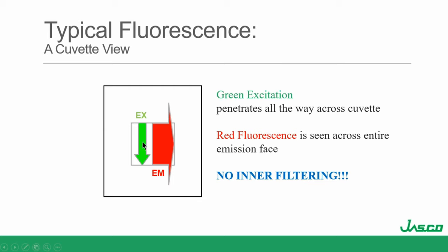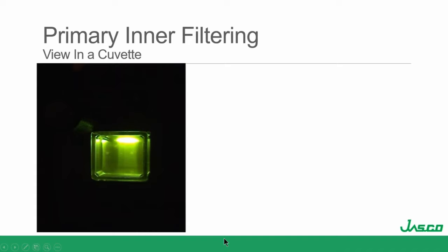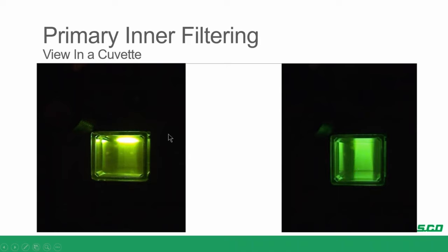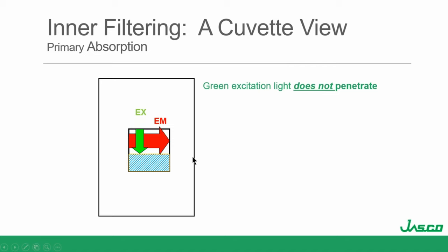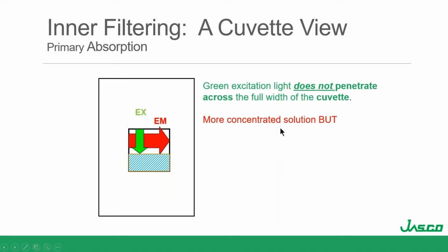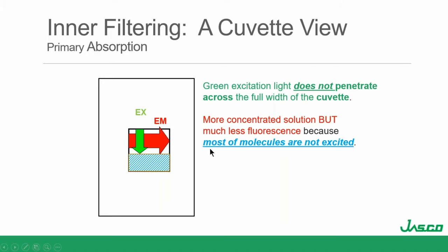There are two types of inner filtering: primary and secondary absorption. In primary absorption, the solution is so concentrated that all of the molecules at the front absorb all of the light — we only see emission from the first couple millimeters of the cuvette. The excitation light does not penetrate across the full width of the cuvette, so we have a more concentrated solution but much less fluorescence because most molecules are not excited. This is primary absorption — sometimes called a pre-filter effect, because it occurs before the emission of a photon of light.